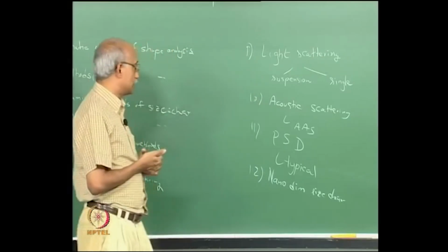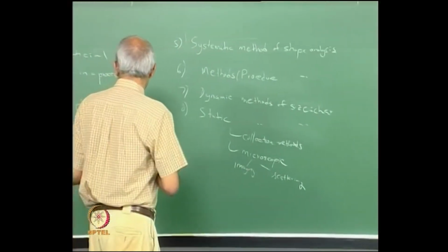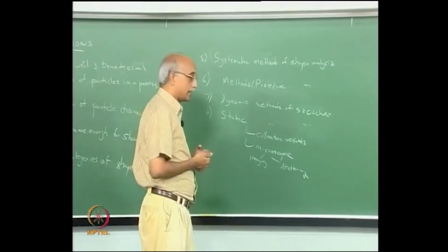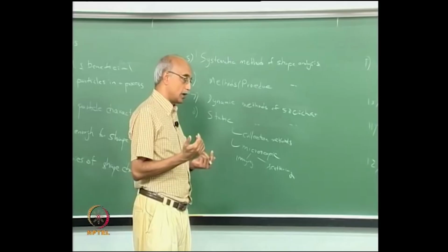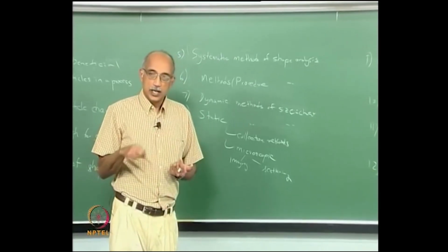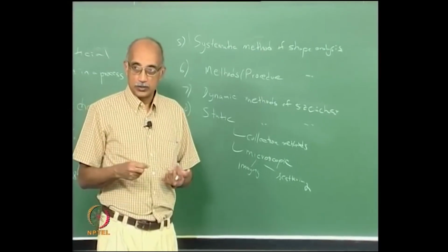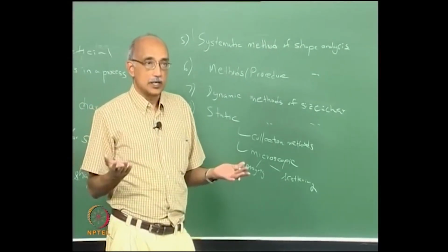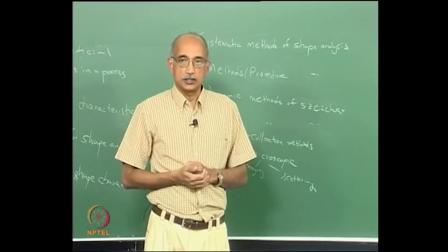And of course, even in aspects such as dynamic methods of size analysis, I expect that students who take this course have a background from their undergraduate courses and their laboratory training on how sieve analysis works, for example, or how sedimentation works. So you should be able to recollect those details.